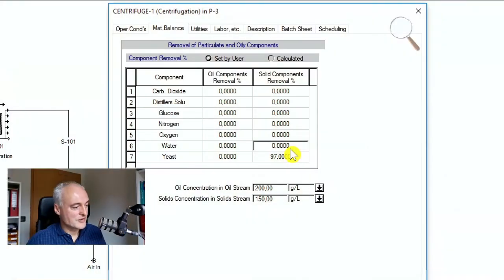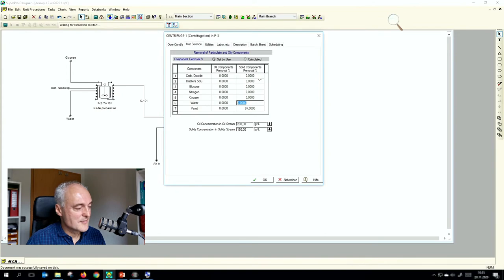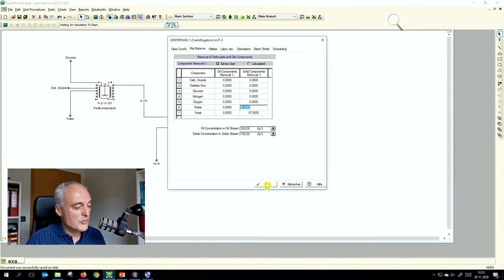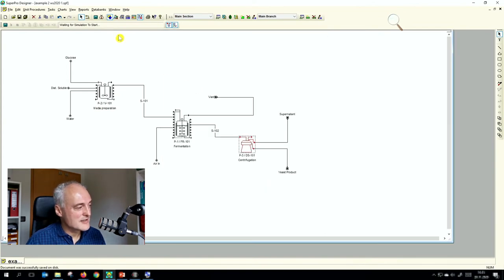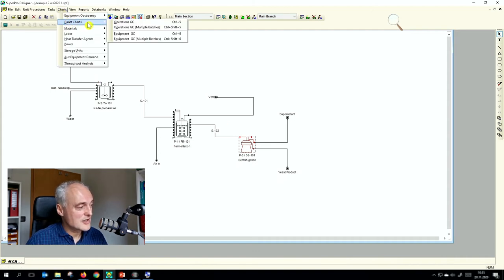We have simply told the centrifuge to remove 97% of the solids. We can now do a mass balance check — it works successfully. However, we haven't touched scheduling yet.